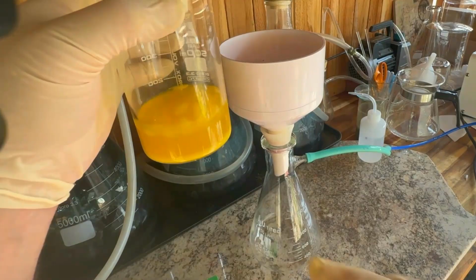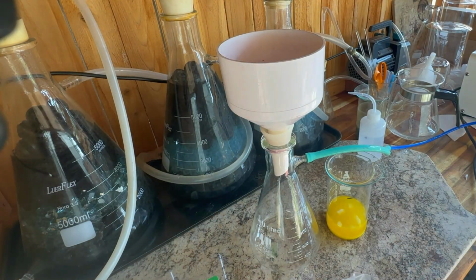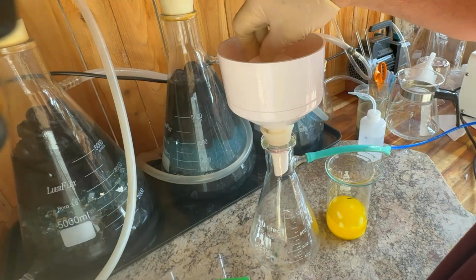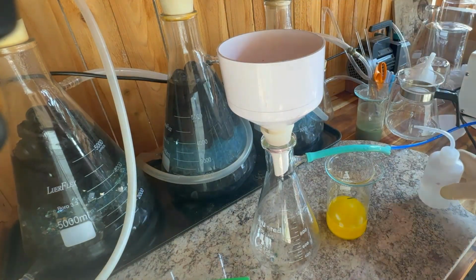So we're set up to filter. See the junk we're going to filter out of here. So we'll use our filters here, number 2. Get that into our funnel. Filter this solution and see what we have.